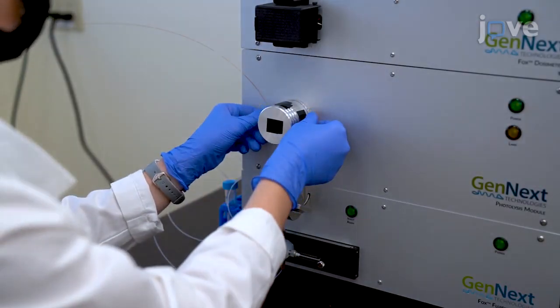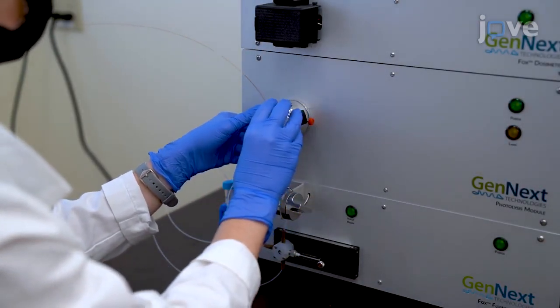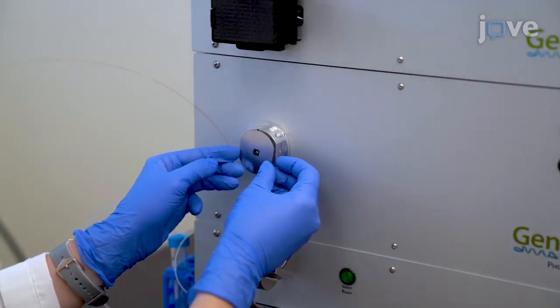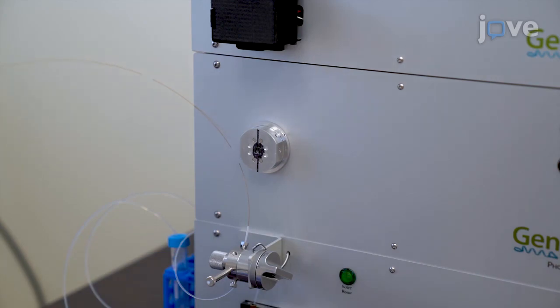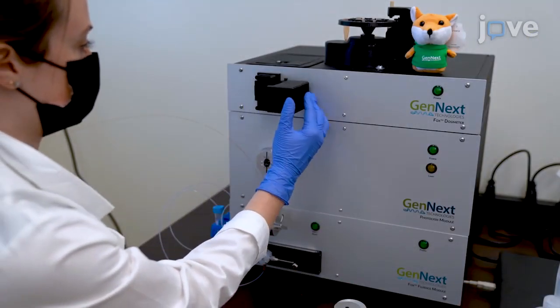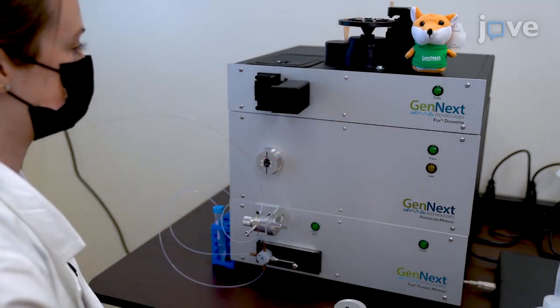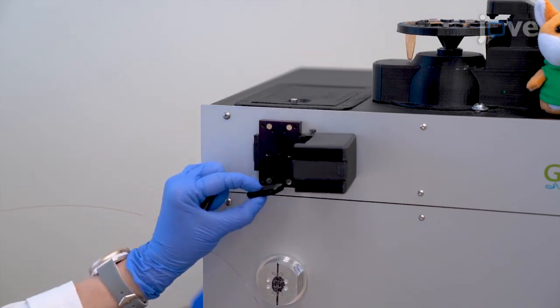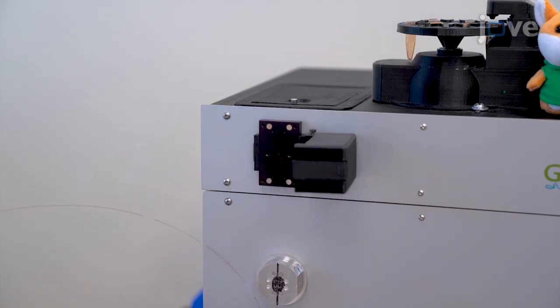Remove the photolysis cell cap of the photolysis module by pulling it straight out. Then remove the magnetically mounted metal mask, which will hold the capillary in place. Open the dosimeter cell by pushing on the tab on the left, and swing the dosimeter cell open to the right. Remove the magnetically mounted clips that will hold the capillary in place.